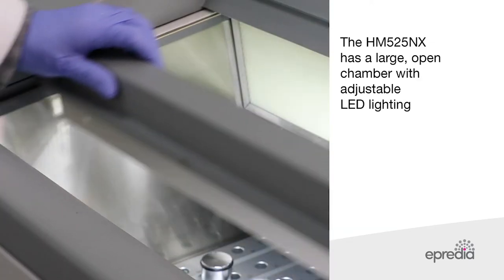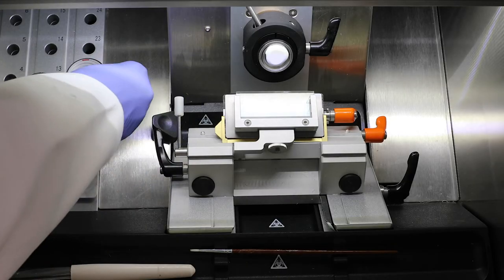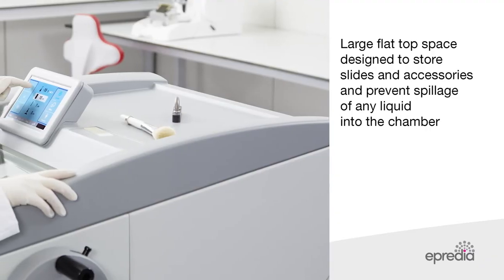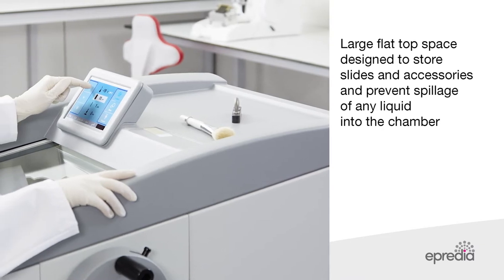The HM525NX has a large open chamber with adjustable chamber LED lighting. There is a large flat top surface designed to store slides and accessories and prevent spillage of any liquid into the chamber.